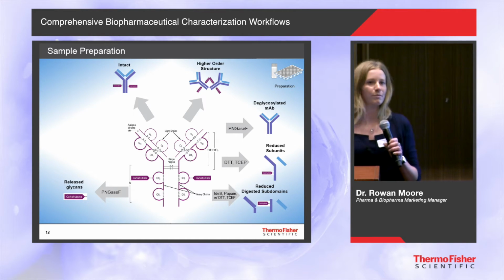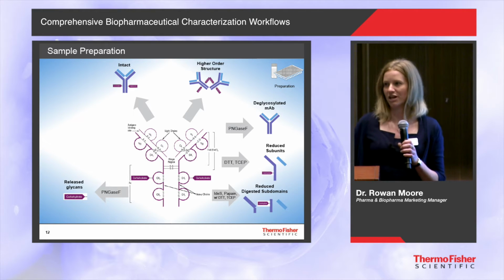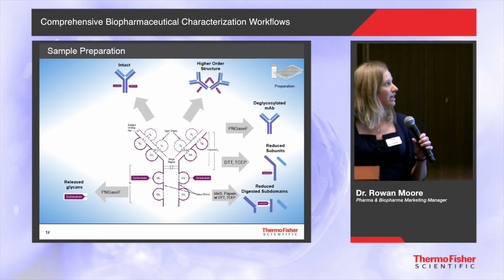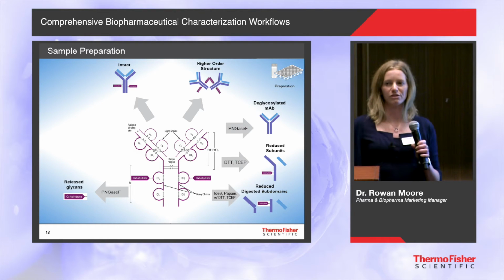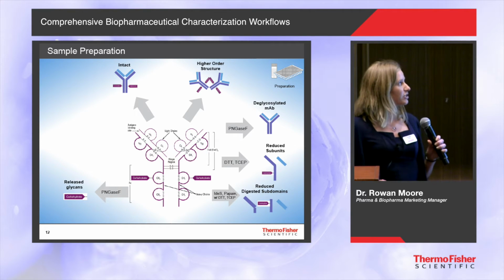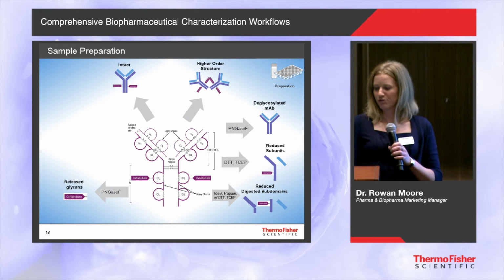Proteins have a propensity to aggregate into dimers, trimers, tetramers, even higher. It's really important that we characterize this and ensure that the levels of different conjugates are consistent from one batch to the next, because these can be involved in immune response.